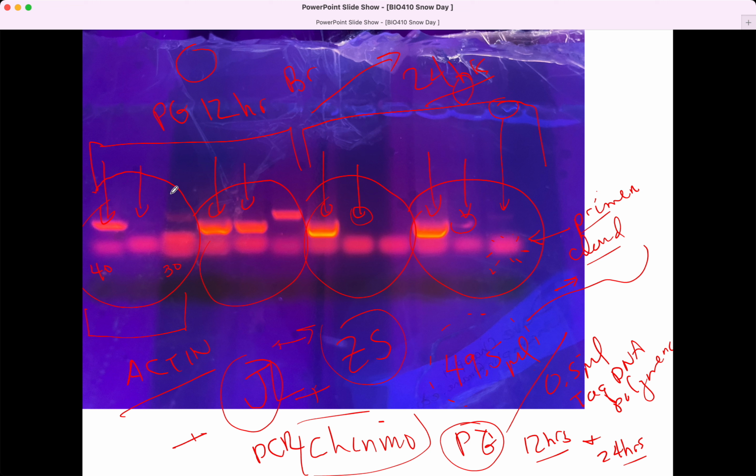And so first group here, just a little bit of product there, more product here. And then third group, no product. Fourth group, a little bit of product. And so I think really sensible results. Concerned about the volume here. We get very little product here. I'm surprised we got any. PCR is pretty fussy, but we seem to have got a little product here.